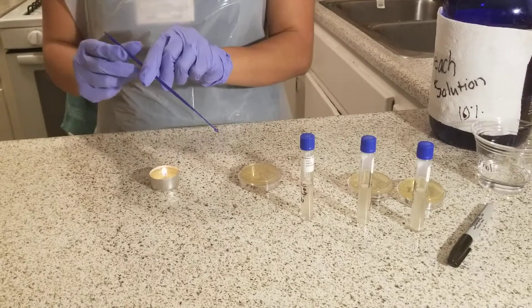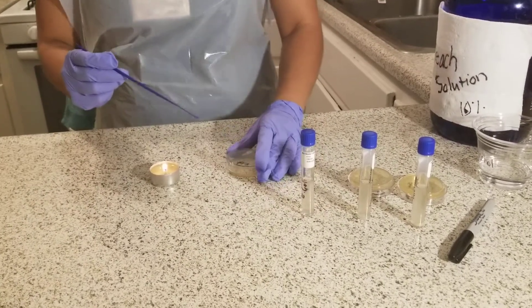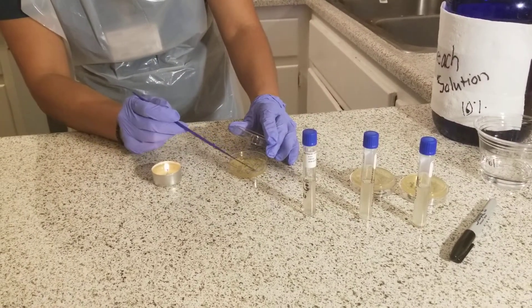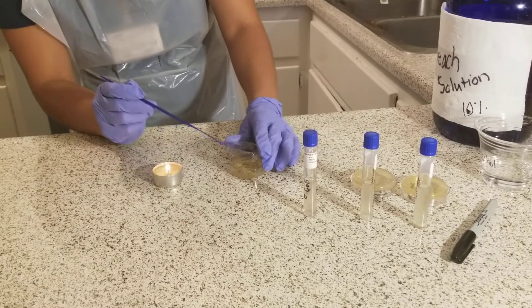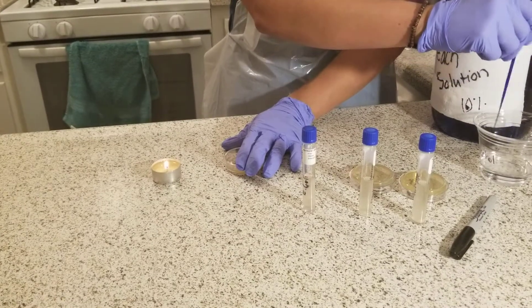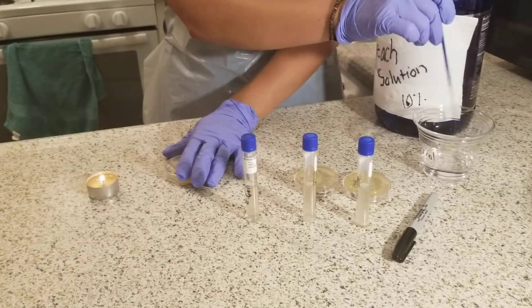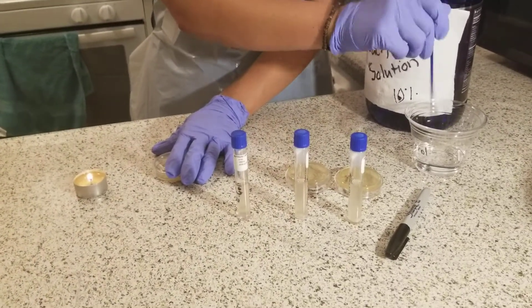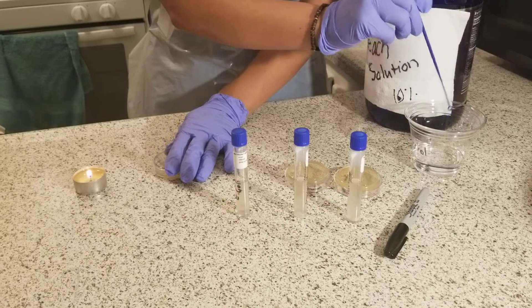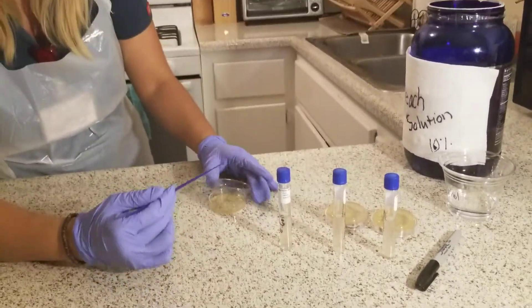Then with the loop, I am going to create a streak plate. It consists of four quadrants. First I will start at the top and go straight back and forth. Then I will take it back into the alcohol, let it sit and then let it dry for 20 seconds. And then after it dries, I'm going to go from the first quadrant of my microbes that I got from and then go into a second streak.